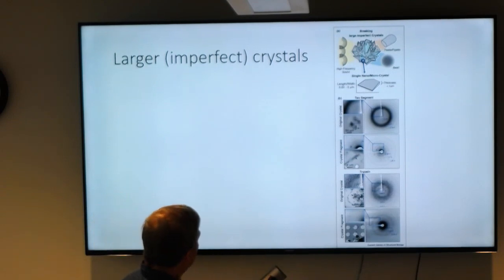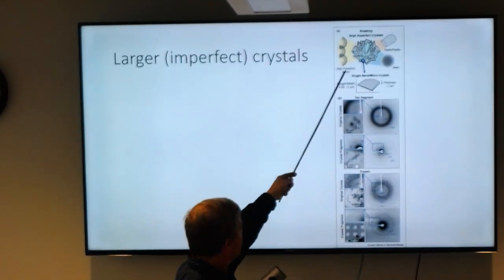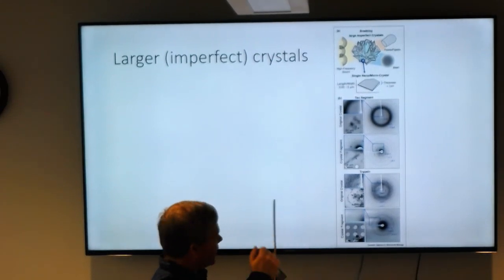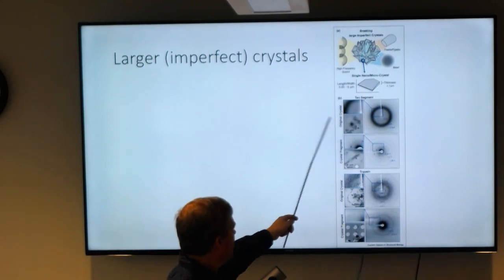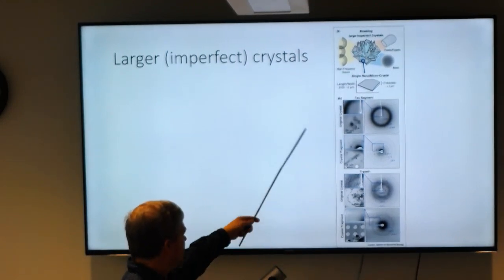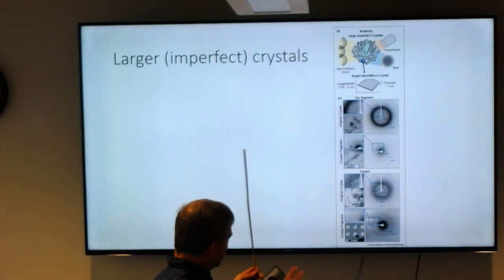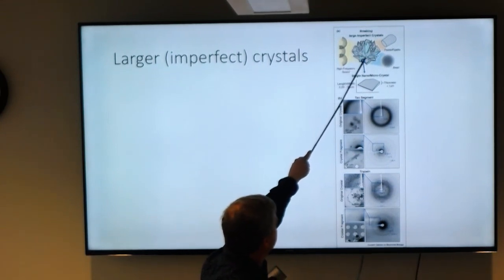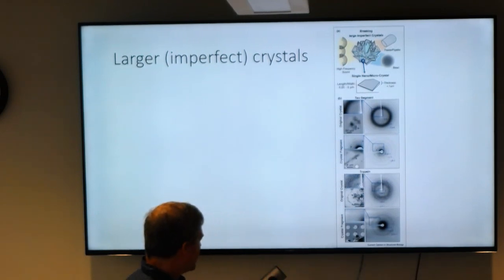So what to do if you do have large crystals is basically try to break them up in solution. They have several techniques. They use, I think, high frequency sound, or just grind it up by pipetting up and down and crush the crystal that way to make them small enough, or image only the small broken crystals that end up on the grid. So instead of imaging this big, ugly multiple crystal, you end up imaging just a little crystal fragment and you get a better diffraction pattern.